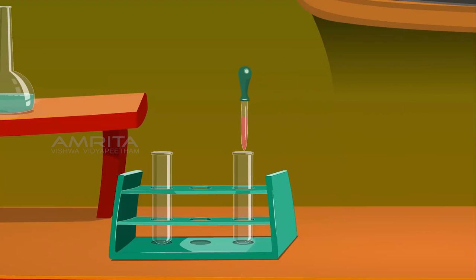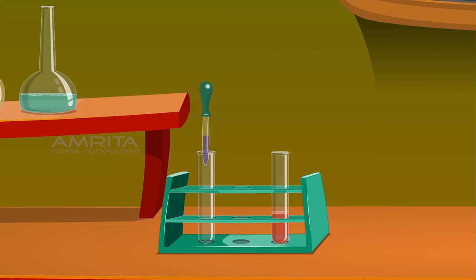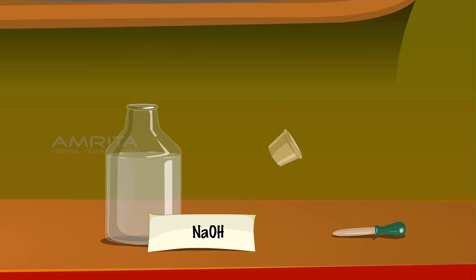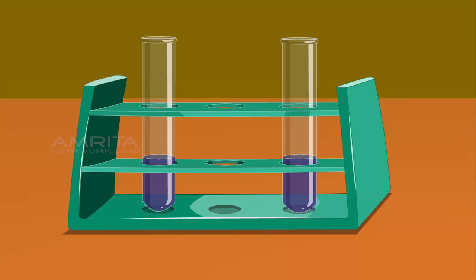Pour the red litmus solution into a test tube. Take the blue litmus solution and pour it into the other test tube. Take a few drops of NaOH solution from its bottle using the dropper. Add this to the test tube containing the red litmus solution and note the change in colour. The colour of the solution changes from red to blue.